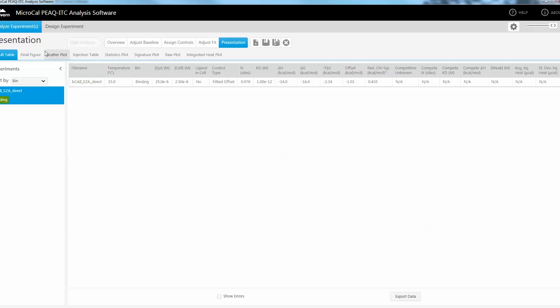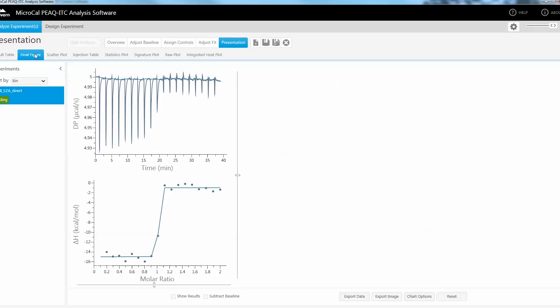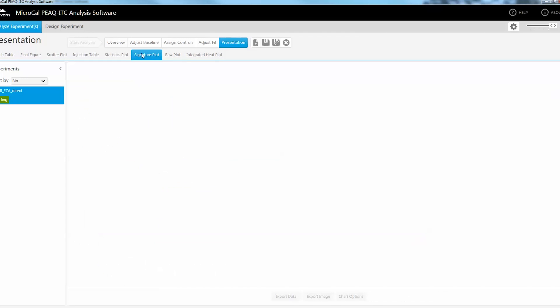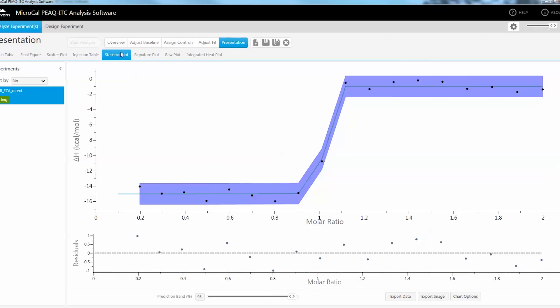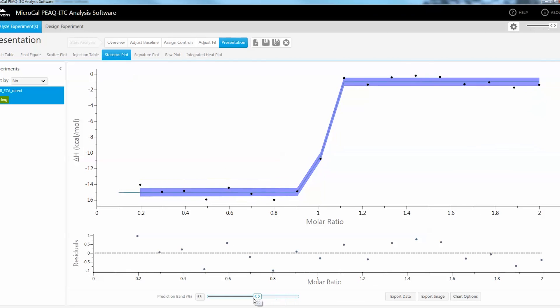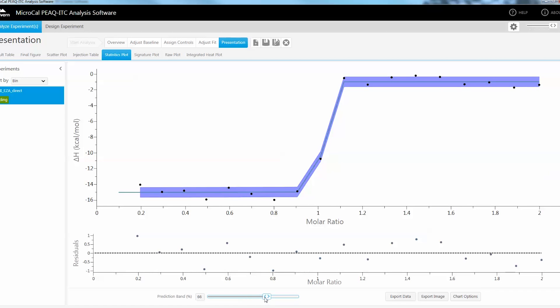MicroCal Peak ITC analysis software offers experiment design simulation, batch evaluation of large datasets, automated assessment of data quality, and a streamlined user interface that guides the user to final figures and presentation quality graphs quickly and easily.